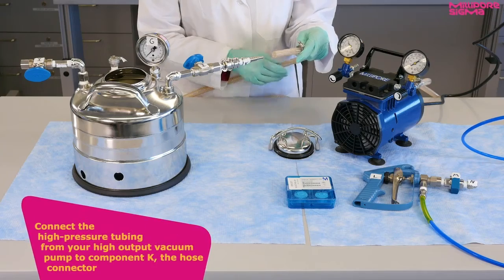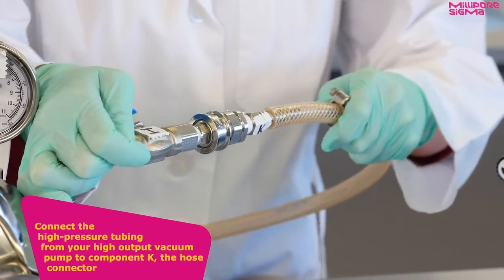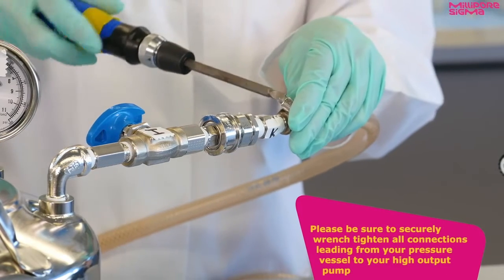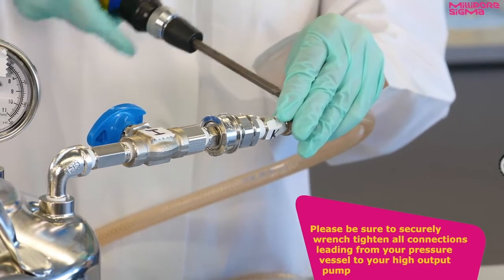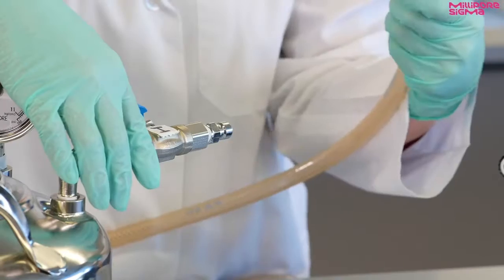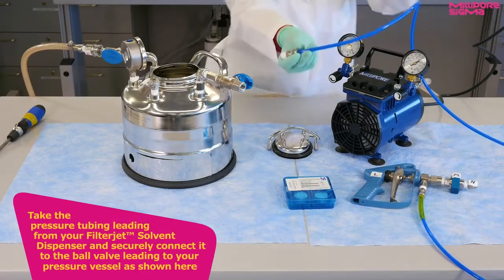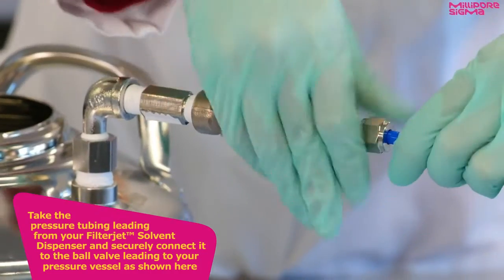Connect the high-pressure tubing from your high-output pump to component K, the hose connector. Please be sure to securely wrench-tighten all connections leading from your pressure vessel to your high-output pump. Take the pressure tubing leading from your FilterJet solvent dispenser and securely connect it to the ball valve leading to your pressure vessel as shown here.